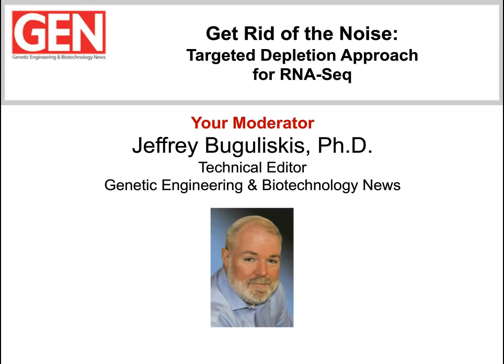RNA sequencing, or as it's often called RNA-seq, is revolutionizing the field of transcriptomics. This immensely sensitive technique reflects the dynamic nature of gene expression and captures an immense array of biochemical complexity. Yet, for all its intricacies and power, the one thing that makes this next-generation sequencing technique so interesting is the very thing that makes it challenging, RNA.